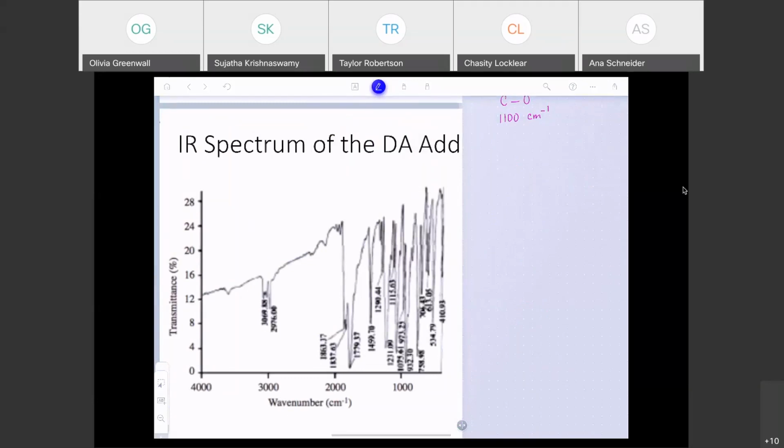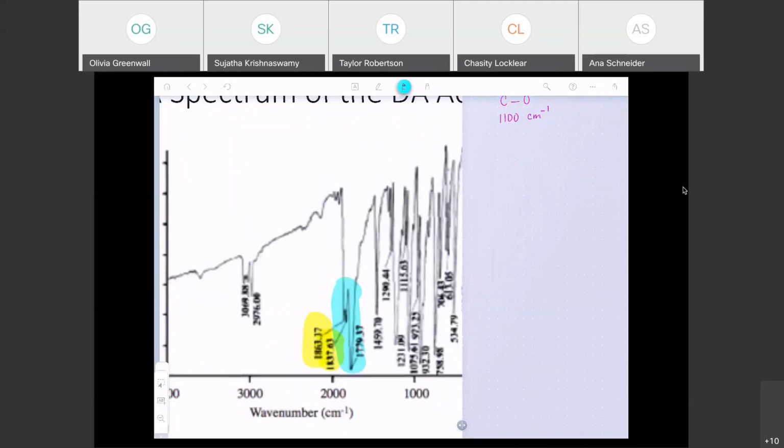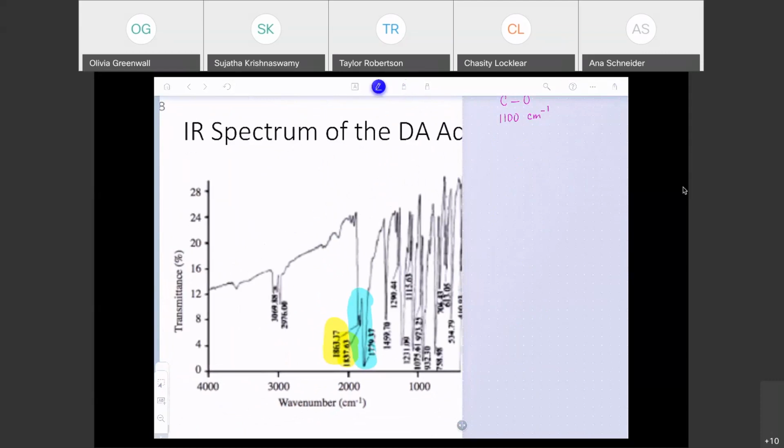So we are looking at two bands here, and as unclear as this may be, you just cannot miss it. Look at that symmetric stretch. You do see that very nicely. And then you see another longer stretch. So we're going to identify all of them. We have three numbers there, and I'm going to give you those numbers here.